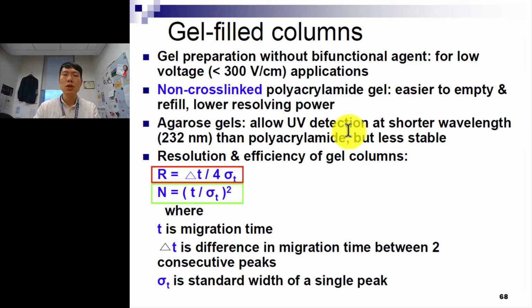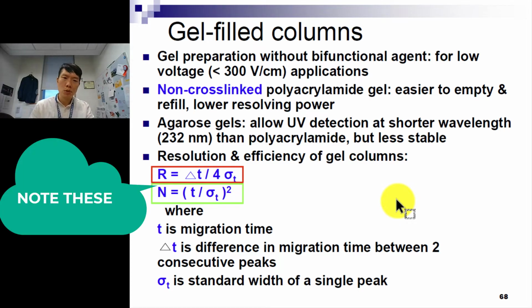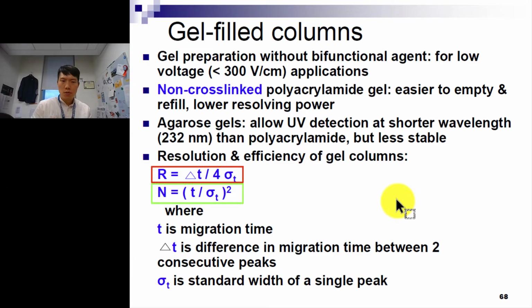However, when you use agarose gel, this allows UV detection at a shorter wavelength, closer to the UV side, which is more powerful, but it's less stable. No matter what kind of gels we use for PAGE in gel-filled columns, it follows this rule about resolution and efficiency, dependent on the migration time and the standard width of the single peak. This is how we calculate which one has a better resolution.